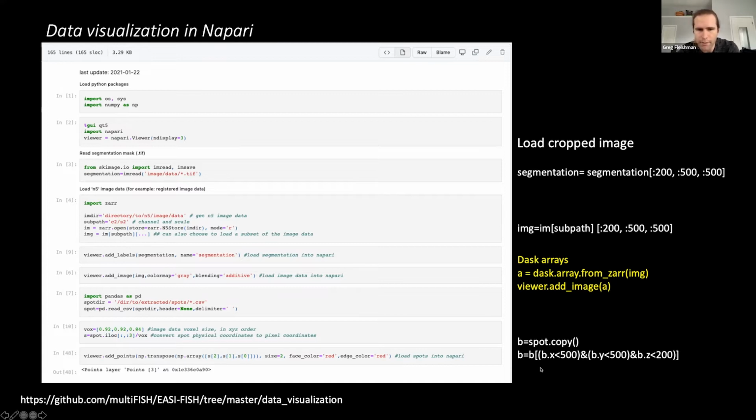So that's pandas data frame syntax for filtering based on range for a particular row, X, Y, and Z. Okay, cool. But I guess you can also just load it as a NumPy array, and then use the logical indexing to crop that way. Yeah, I don't think one's better than the other. I just want to know what the syntax is and how it works. Yeah.